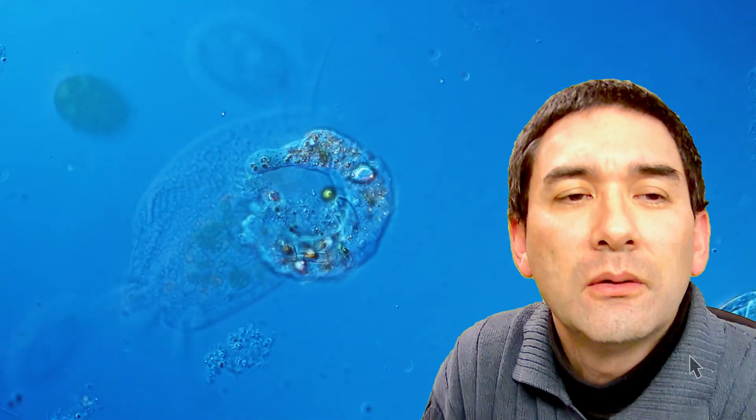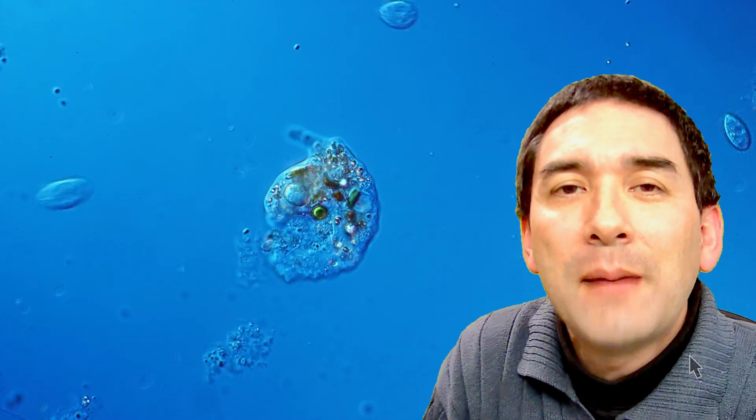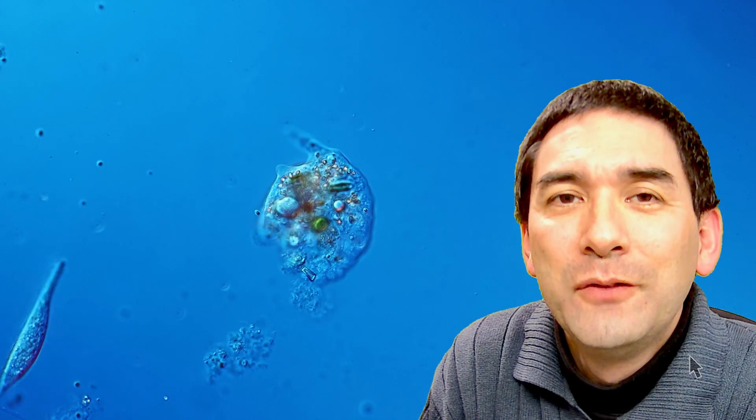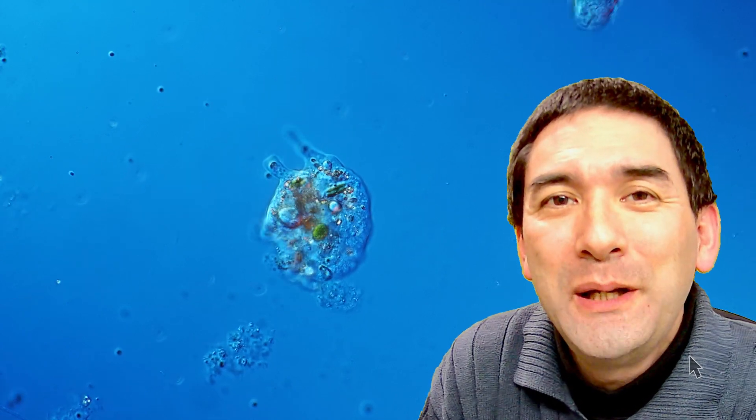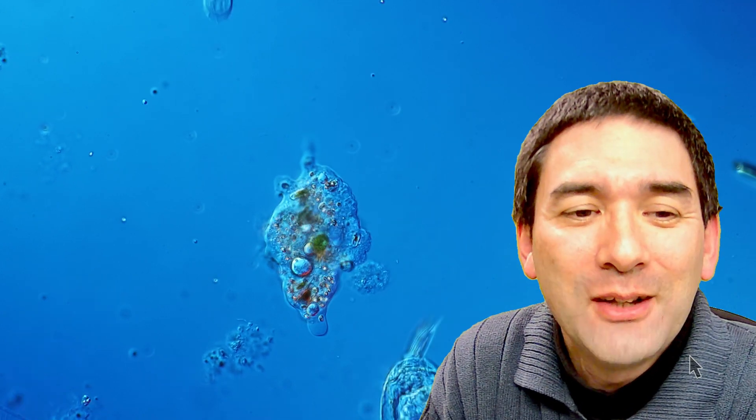It actually looks almost like it. And this one is one of my favorites here. This is in time-lapse an amoeba. And this amoeba as well, if you look carefully in it, has some green parts inside the cell. And these are also some algae and some diatoms that it has eaten.